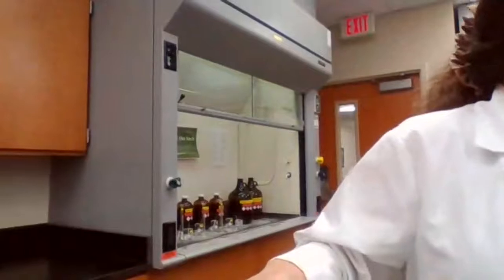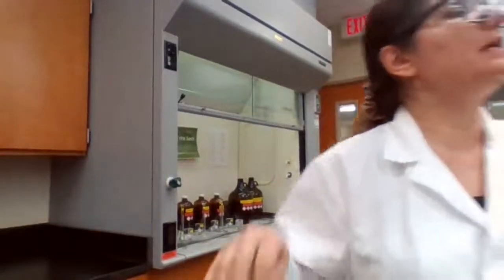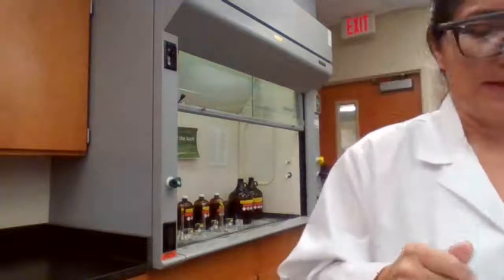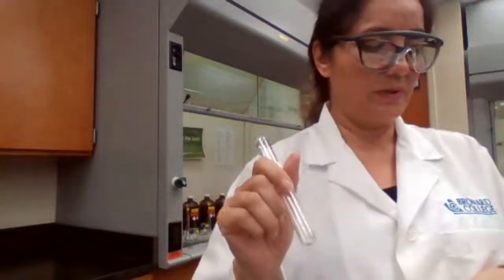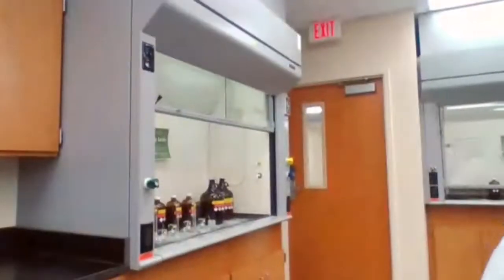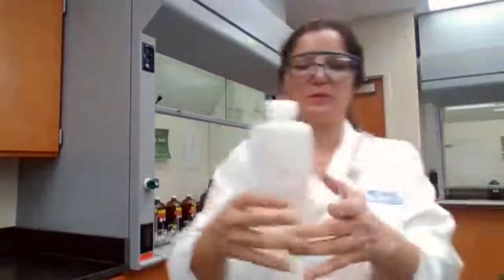For an endothermic reaction or exothermic reaction, how a heat or ice bath or hot water bath is going to affect the shifting of equilibrium. Part D of the experiment, that's the last part. In a test tube, we are going to add deionized water, and we are going to make it half full of deionized water.